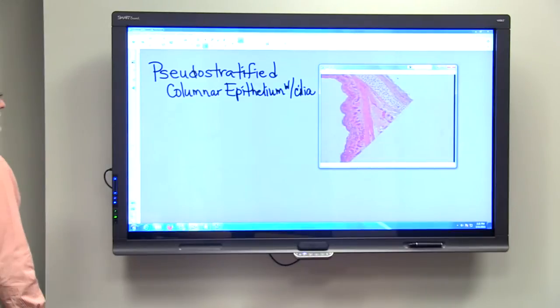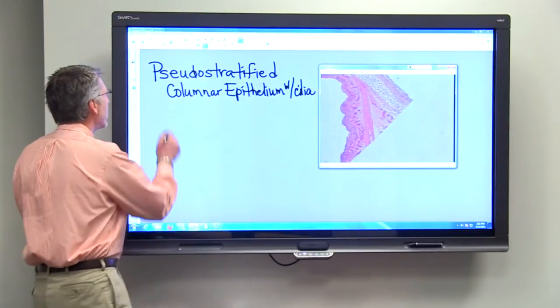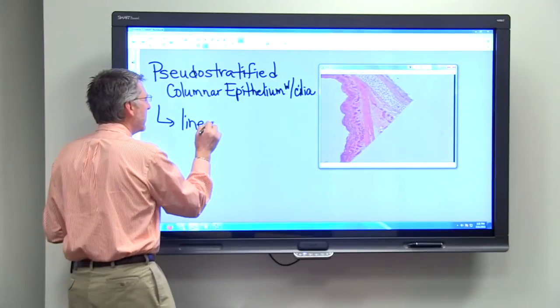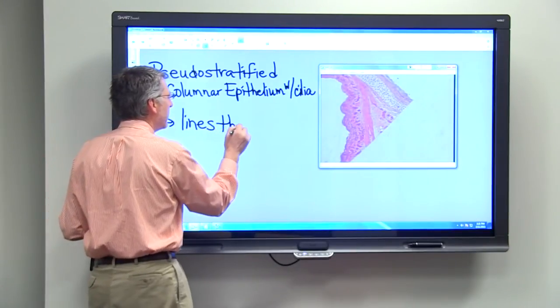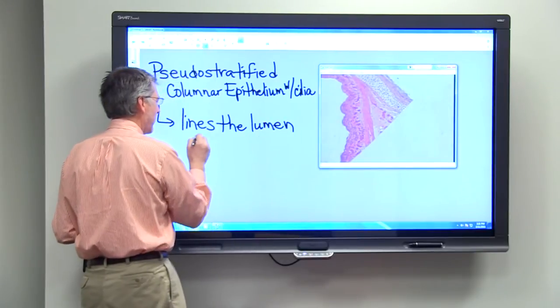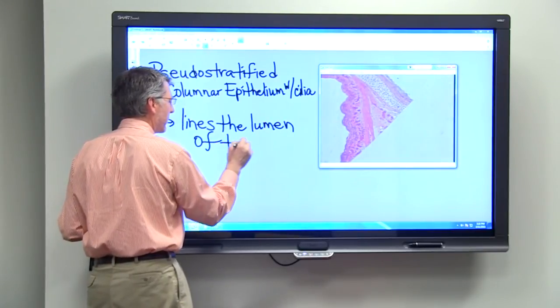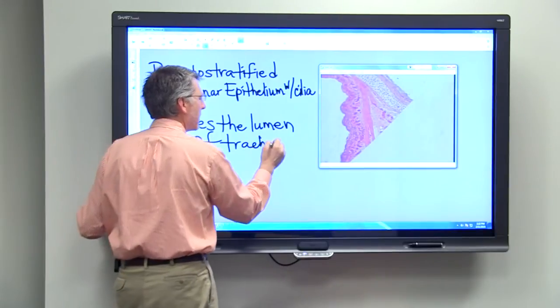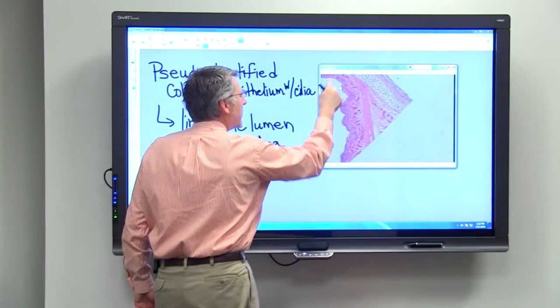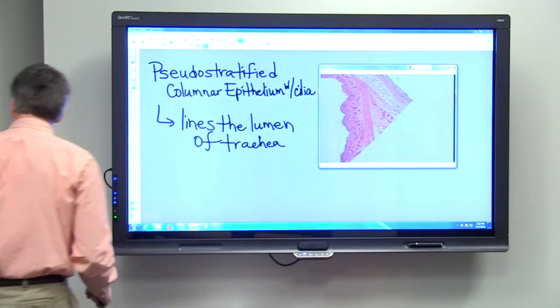The pseudostratified columnar epithelium with cilia lines the lumen of the trachea. We want to go up on a higher power and observe this tissue lining the lumen.